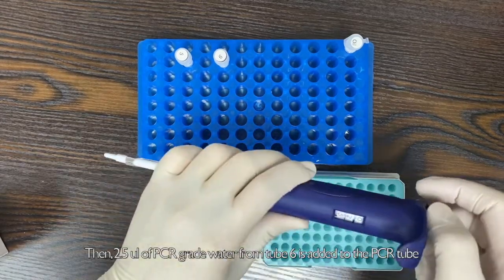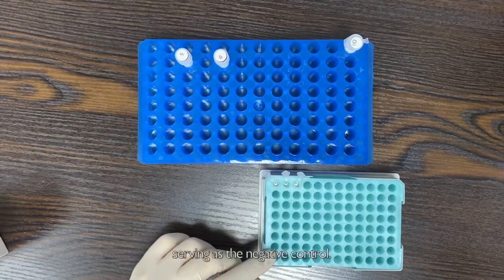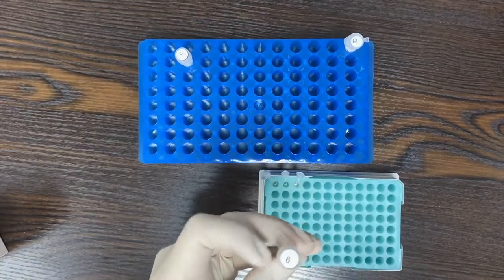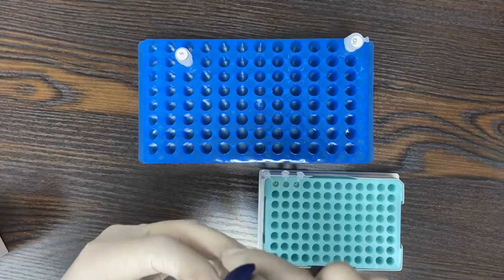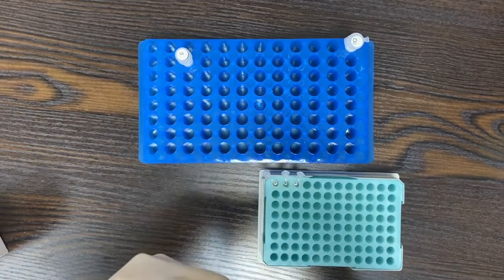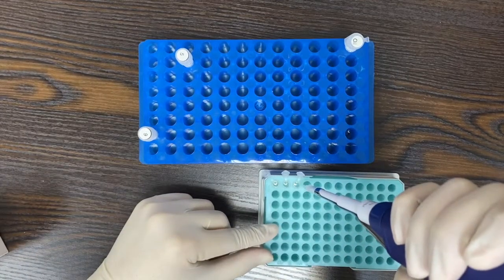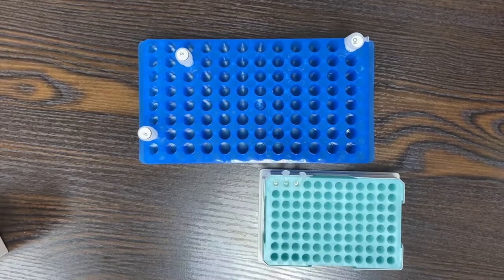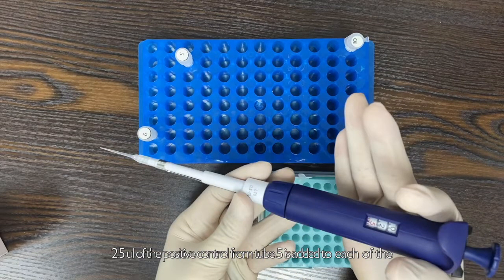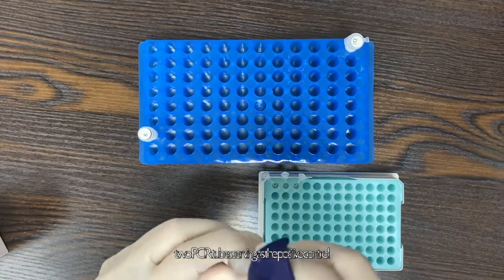Then, 2.5 µl of PCR grade water from tube 6 is added to the PCR tube serving as the negative control. 2.5 µl of positive control from tube 5 is added to each of the 2 PCR tubes serving as the positive control.